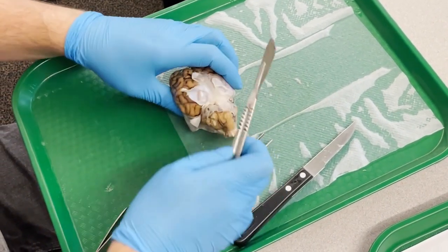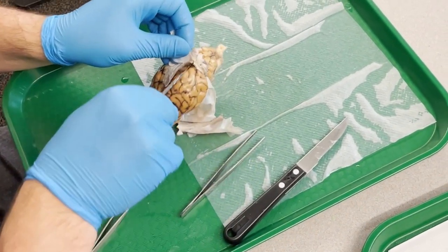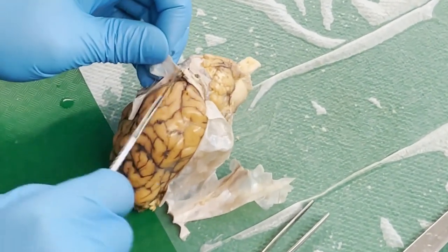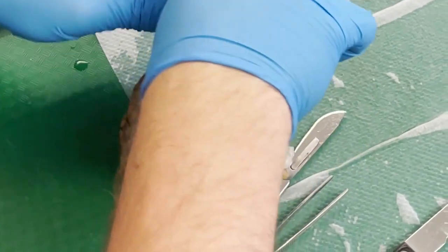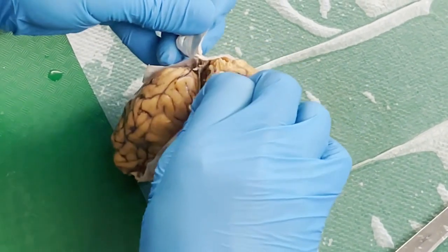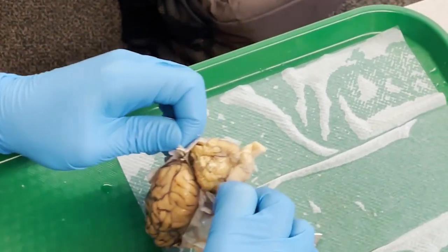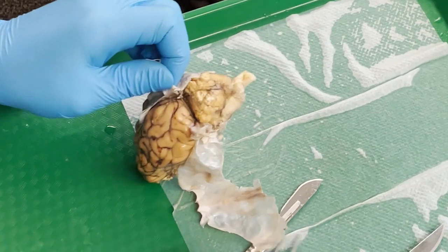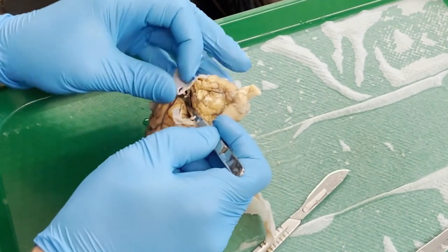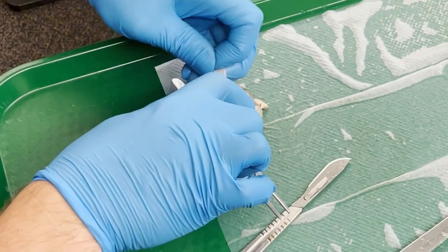Okay. Go from the back a bit, and get in there a little bit more. Okay, I think I've split it up a little bit, and now it should be able to be separated. I know. Yeah, so it's still down in there. Gonna have to pull up a piece and then try to excise it, it looks like. Woo, all right. Let's pull this part back then.